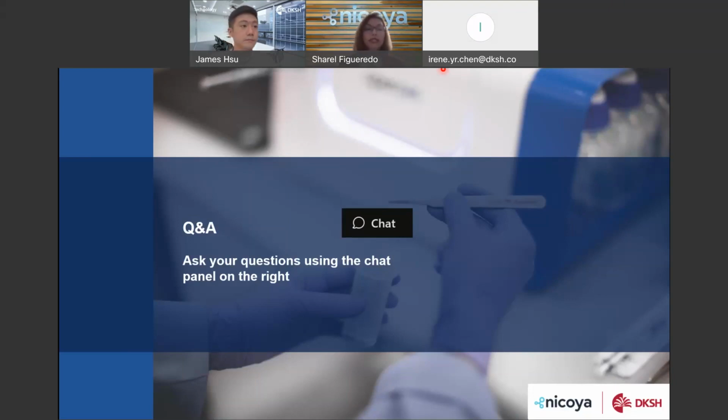So as long as the ligand is stable on the sensor chip, it has not degraded, as long as the ligand has not come off, you can reuse the sensor. Typically, we would say at least 60 to 80 runs you should be able to do. Again, it would depend on the type of ligand or what type of protein is used as a ligand.